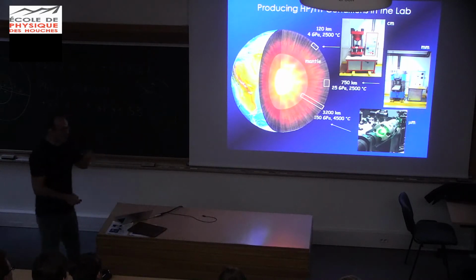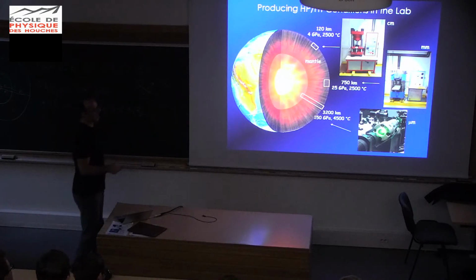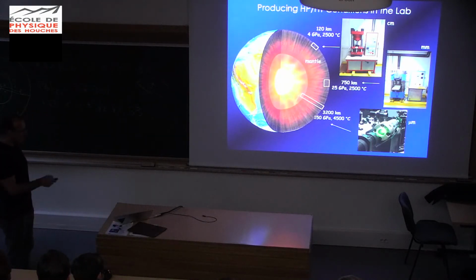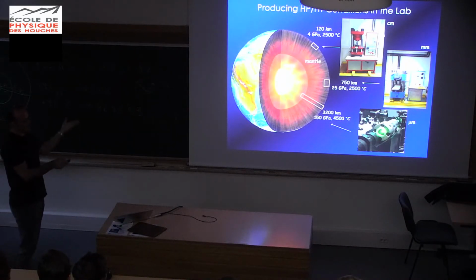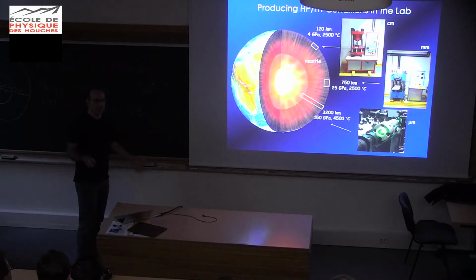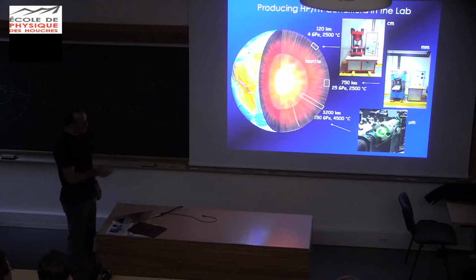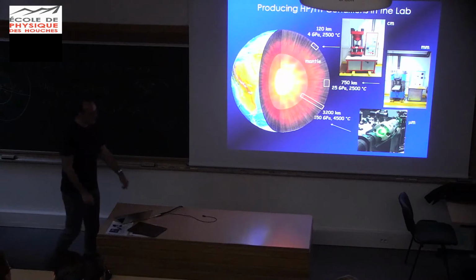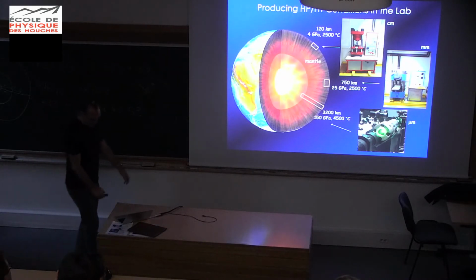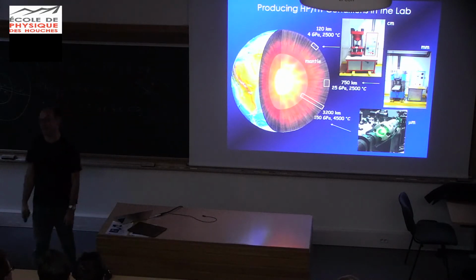Okay, so here are the three basic types of presses that you would find in most earth science research institutions. Maybe they don't have all three, but if they're specializing in the lithosphere, you're bound to find many of those. If they're specializing in the upper mantle, they would have these. If they're doing more lower mantle and core work, you would find this. But these are basically the three standard ubiquitous tools that you find to generate high pressures in research labs. Do you have any questions? Technical questions? Something that I did not address? Yes.